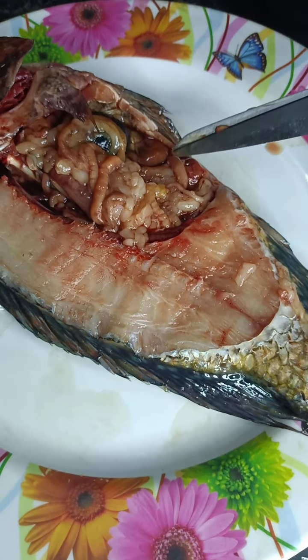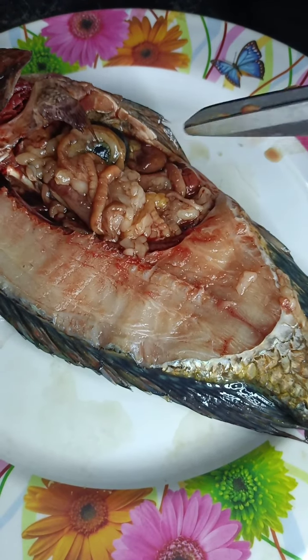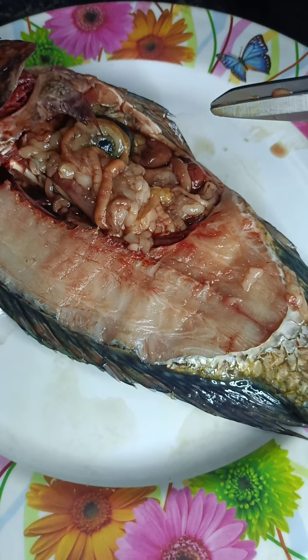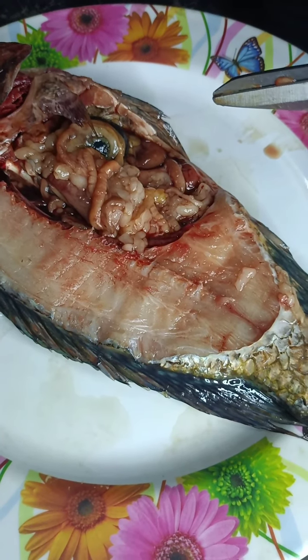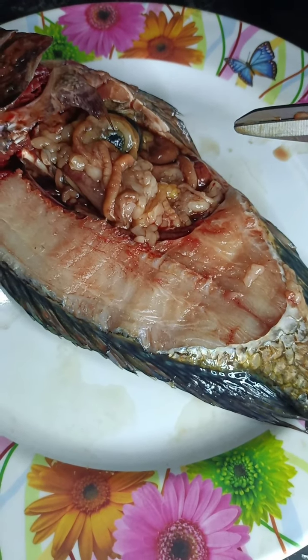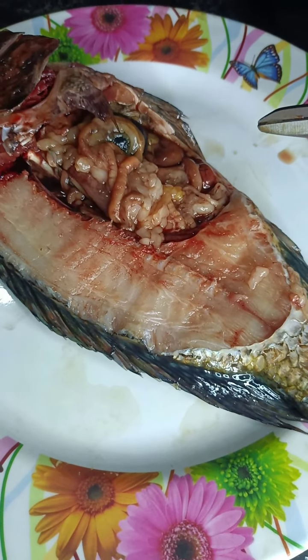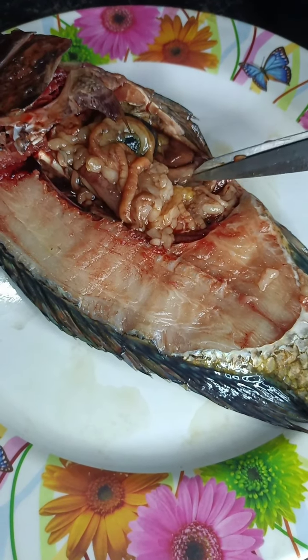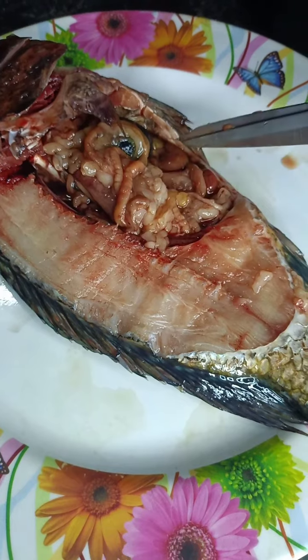So now we have the gonads. The female gonad produces oocytes with follicular cells through type 2 division. By contrast, in males, germ cells keep dividing as type I germ cells during both the embryonic and the larval stage. So that is the gonad.